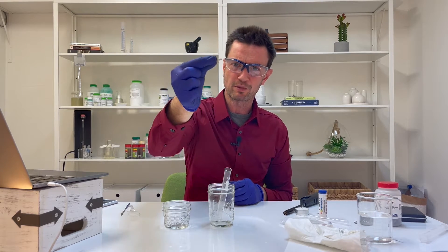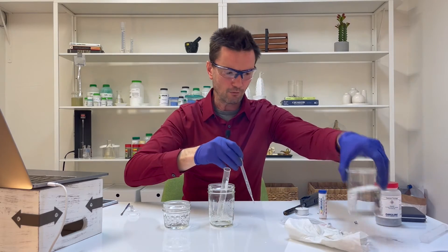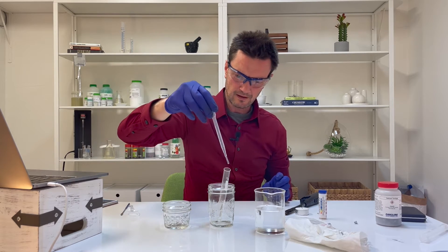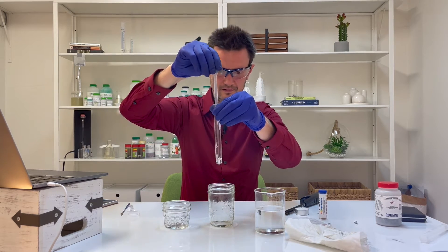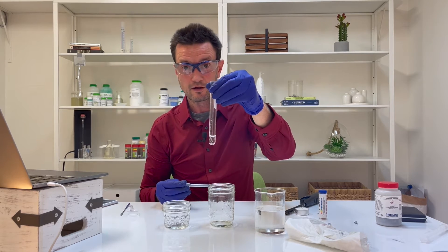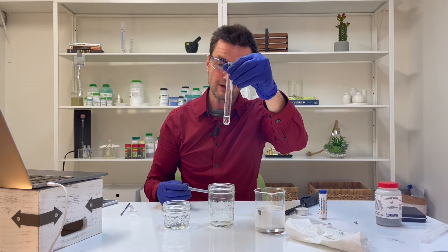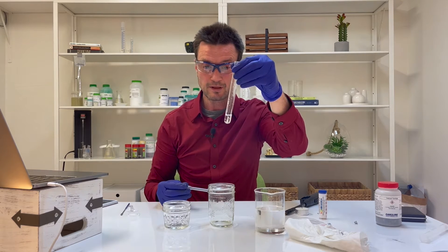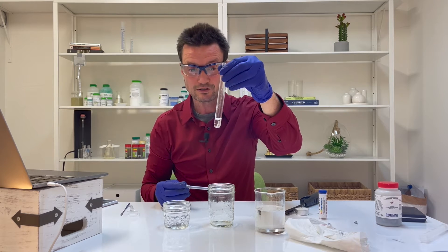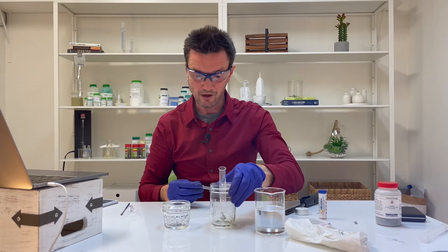Take one or two one-centimeter pieces of magnesium and drop them into your test tube. I have water in this beaker — about three milliliters of water should be sufficient. Water, relative to vinegar, is less reactive, so this will not be as vigorous. Your job is to observe how vigorous or not vigorous the reaction between magnesium and water is.